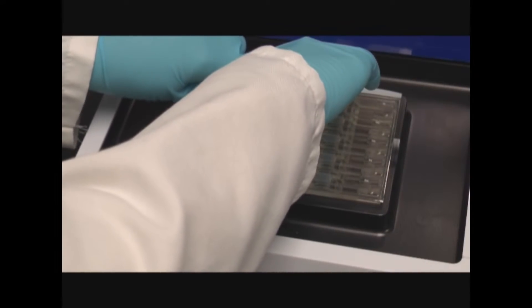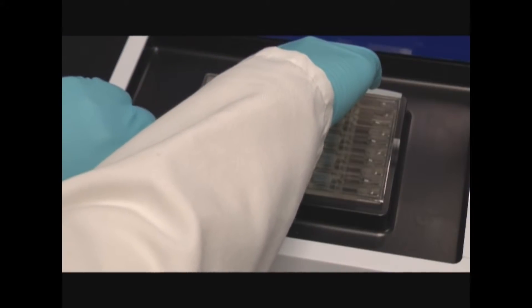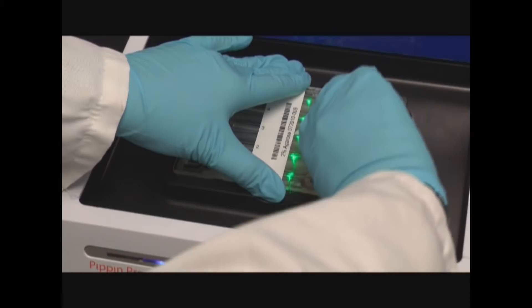Hold the cassette down firmly with one hand and remove the tape seals by pulling the white tabs towards you. Use a slow, deliberate pressure to remove the tape to avoid spilling buffer from the reservoirs.